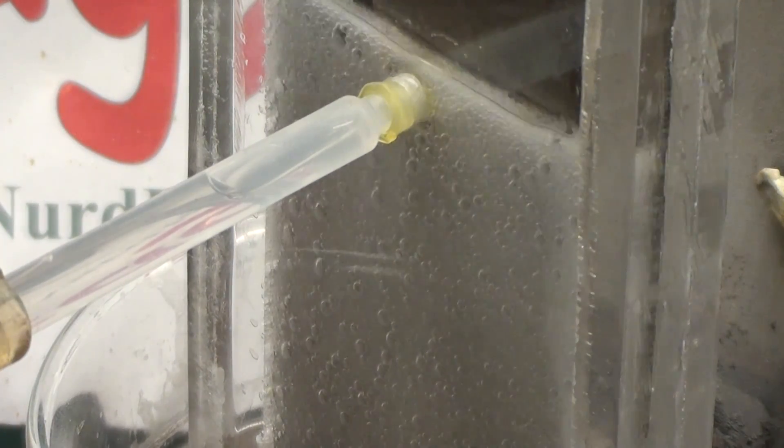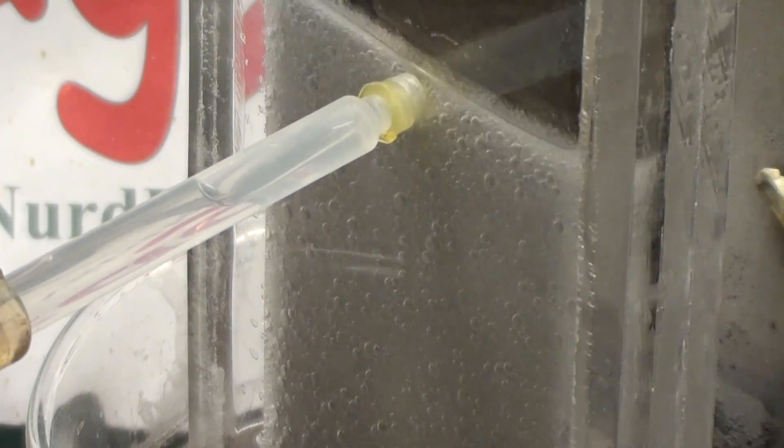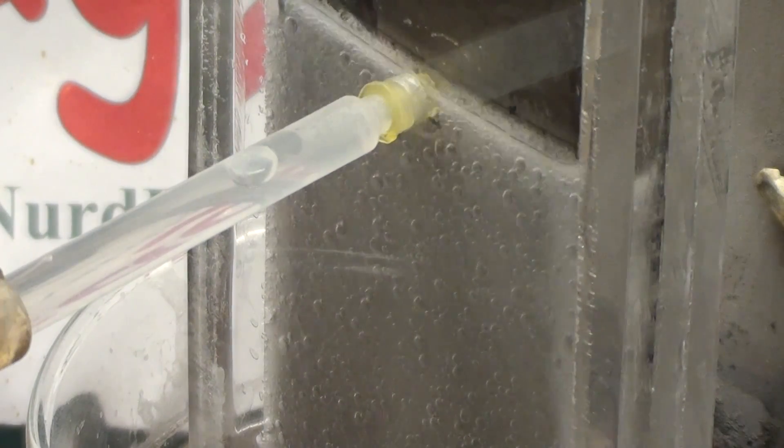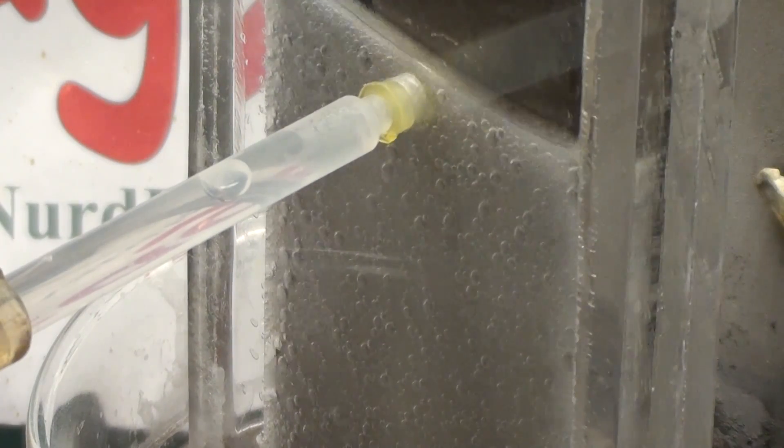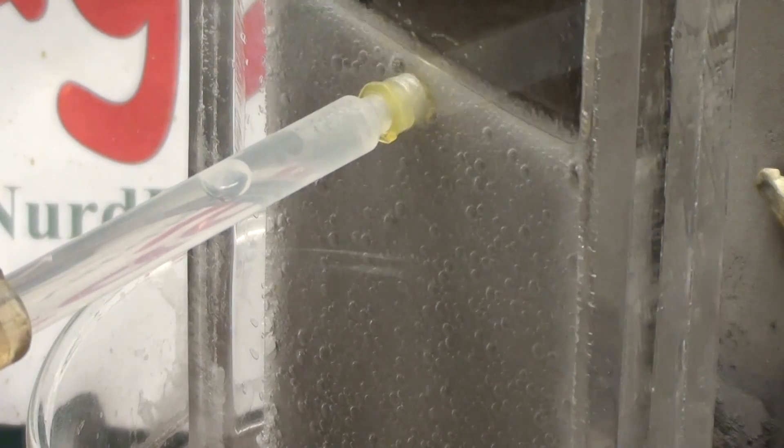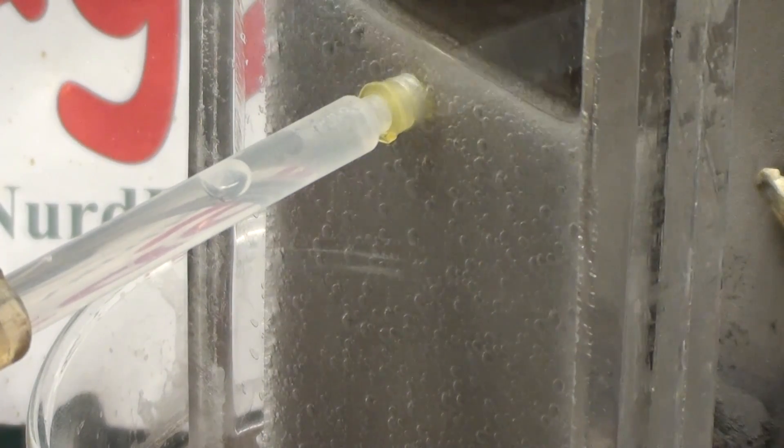It is for that reason we can't really use a cationic exchange membrane like nafion to produce an acid. It would be great if we could fill the compartments with sodium sulfate, separate out the sodium ions and make sulfuric acid. Unfortunately as the pH decreases as the acid builds up, we get rapidly diminishing returns as hydronium ion transfer becomes the dominant reaction.